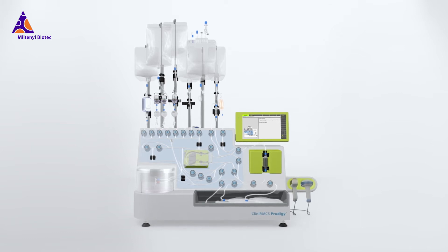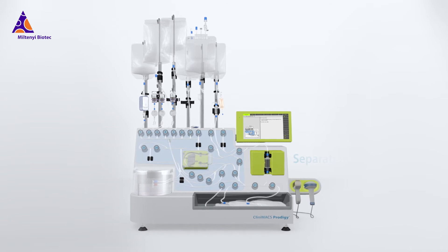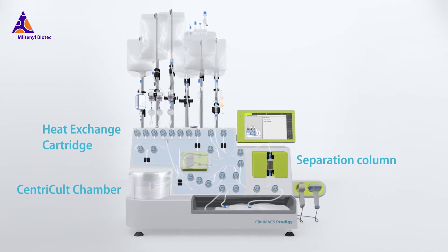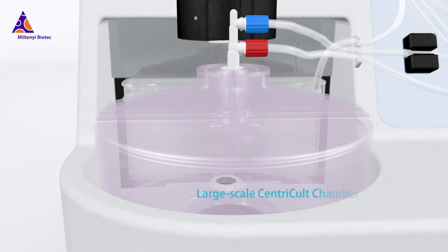Every tubing set is optimized for your desired cell manufacturing application. They come with different selections of pre-assembled components, and a variety of available accessories maximizes your possibilities.